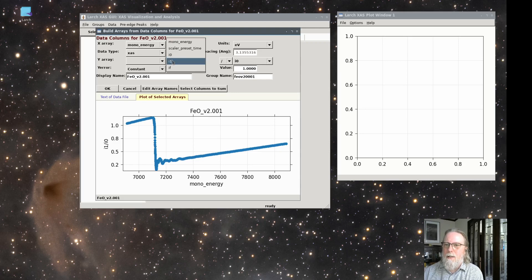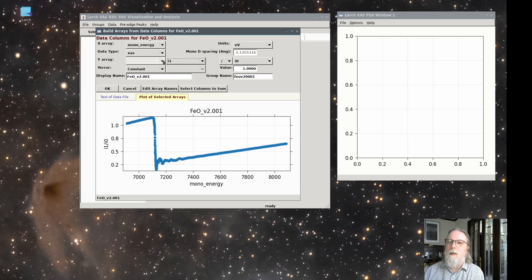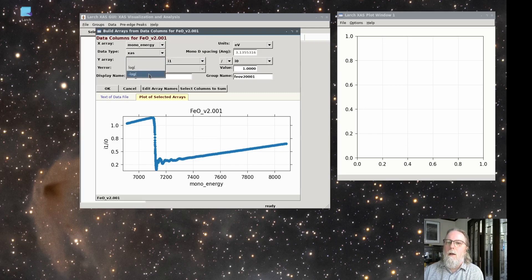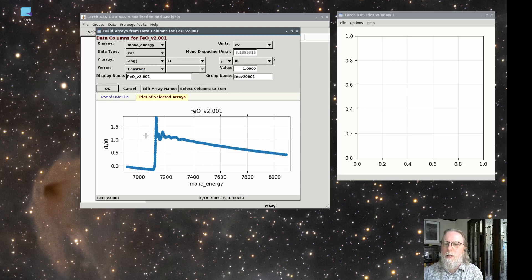This dataset has a few columns. It's got mono energy in electron volts and transmission mode XFS. So we'll take the minus log of I1 over I0. Again, for fluorescence data, it's important to not take the log.